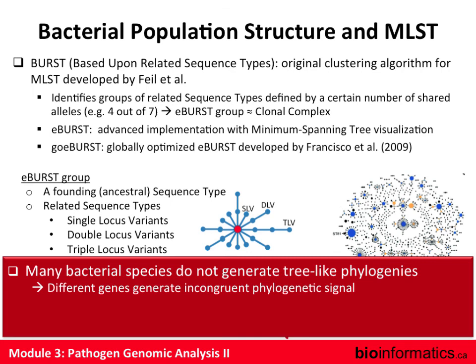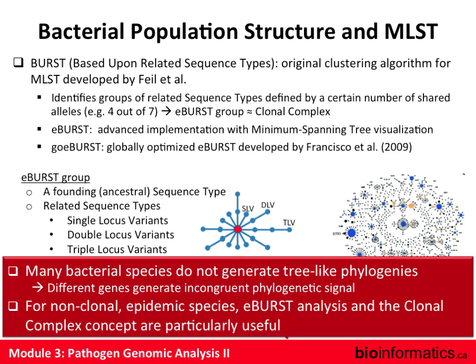And so again, when you're trying to figure out whether to do MLST analysis versus SNP analysis, you have to wonder: am I looking at short-term trends or longer-term trends? And figure out accordingly. So for non-clonal epidemic species, eBURST analysis actually is a pretty good alternative way of doing analysis.